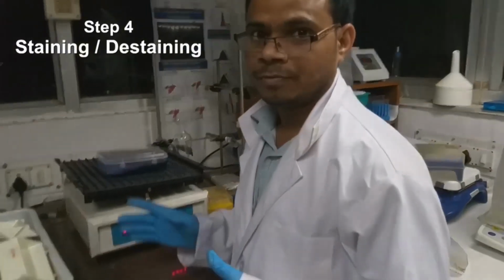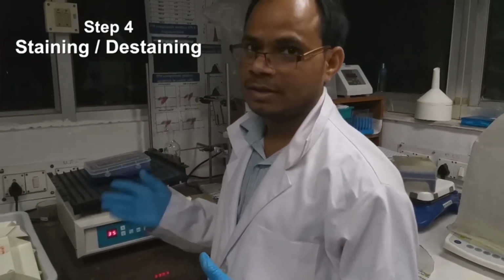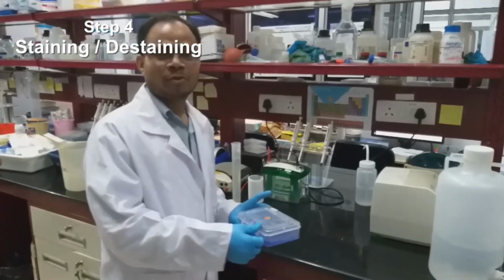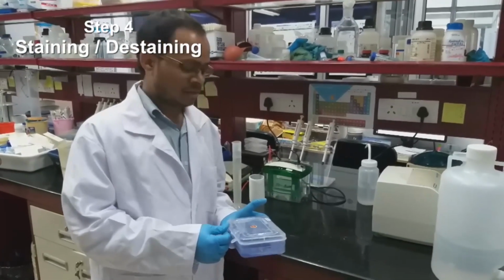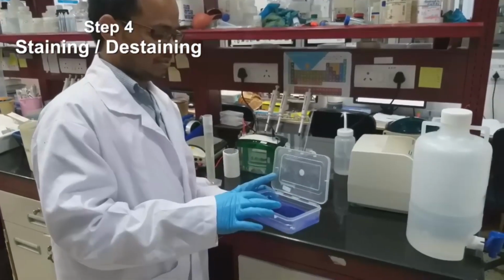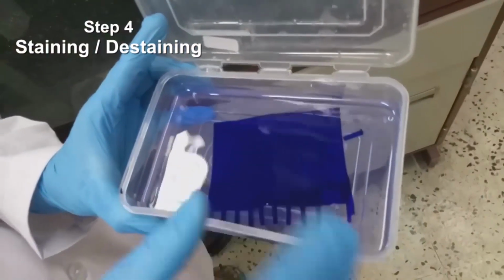So once the time is over, after 2 hours, we will destain. Now we kept it 2 hours in staining solution. As we can see, the staining is over. You can see the gel has completely turned blue.